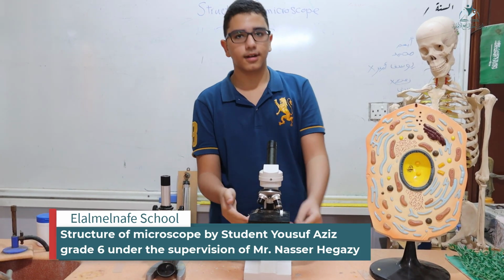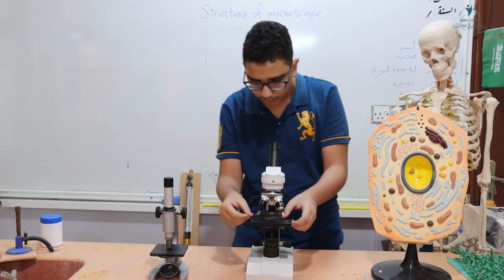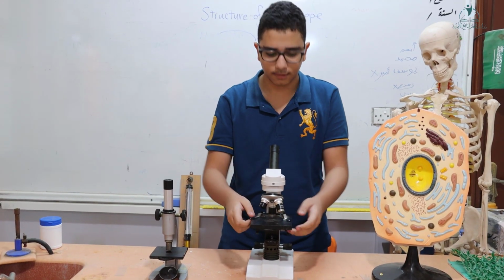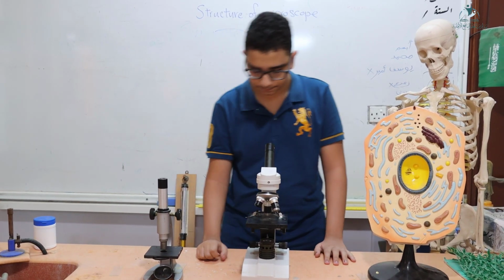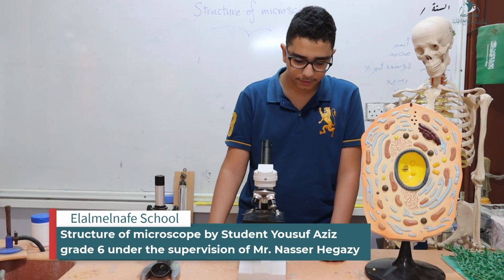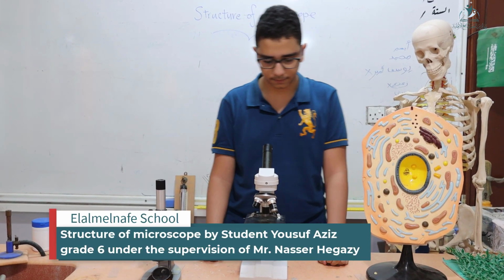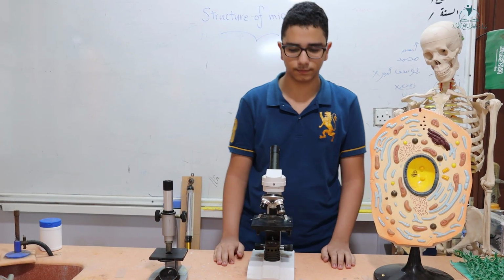This is the stage. It allows us to put the slide on the stage. This is the stage clip. It allows us to fix the slide on the stage. This is the coarse and fine focus. It allows us to see the image more clearly. This is the base, and this is the illuminator or mirror.